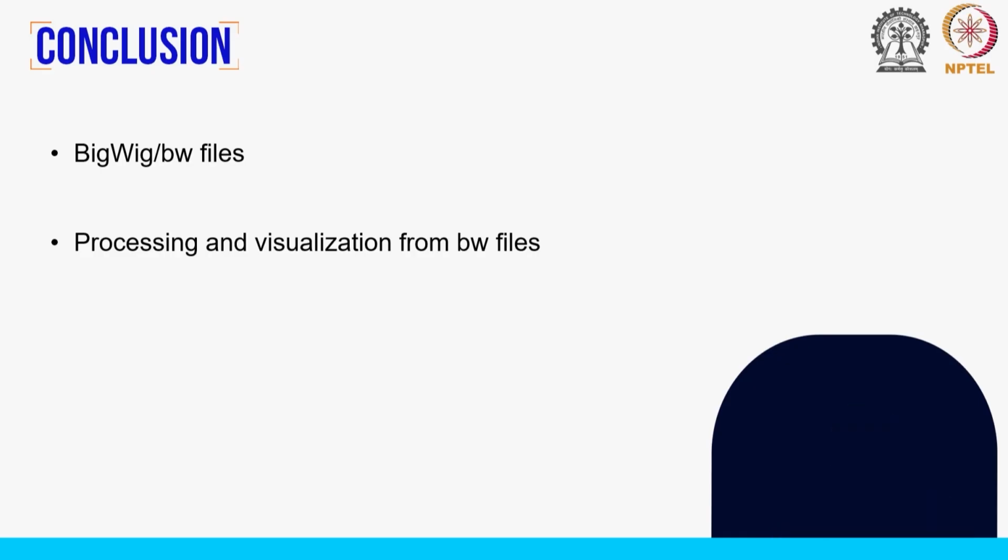To summarize, this week we have looked into ChIP-seq data analysis, and we have worked on two data sets hands on, which have given you an extensive overview of how to process ChIP-seq data. Thank you.